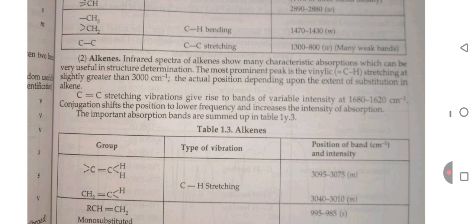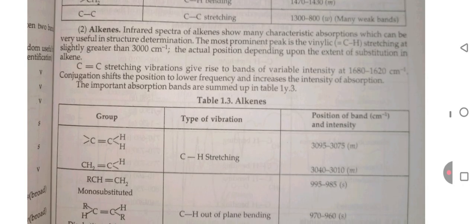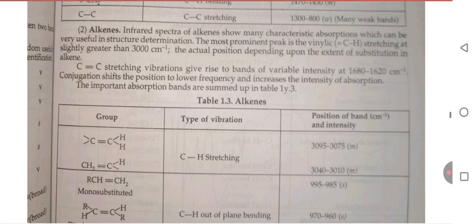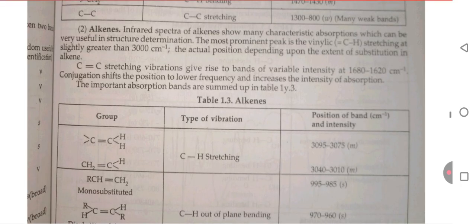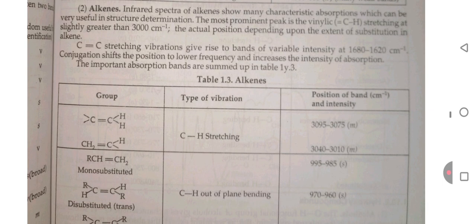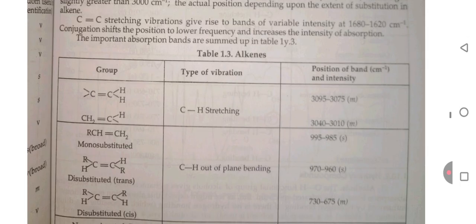Second, alkene. Infrared spectra of alkenes show many characteristic absorptions which can be very useful in structural determination. The most prominent peak is the vinylic C-H stretching at slightly greater than 3000 cm⁻¹, the actual position depending upon the extent of substitution in the alkene. C=C stretching vibration gives rise to bands of variable intensity at 1680 to 1620 cm⁻¹. Conjugation shifts the position to lower frequency and increases the intensity of absorption.